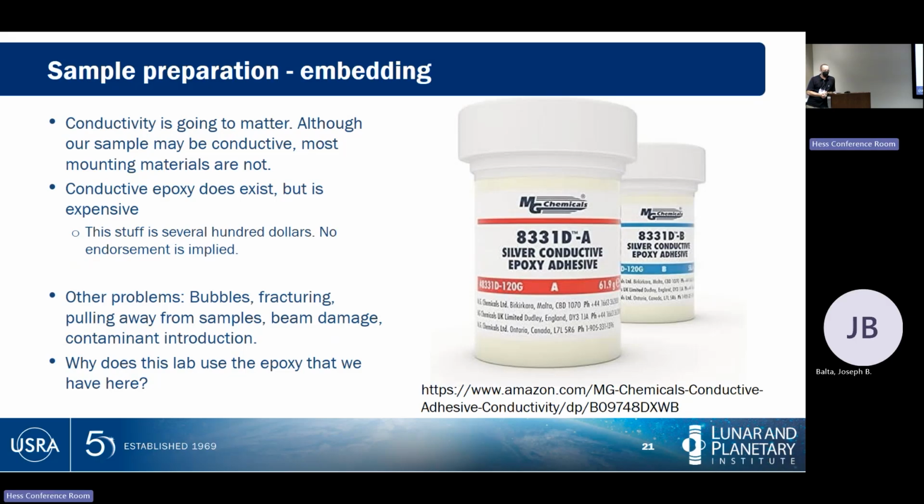So if we want to measure water contents in a moon rock, which is a thing that people measure, you cannot epoxy mount your sample. You have to come up with other things. They have creative methods of using a soft metal and embedding the sample in a soft metal piece of indium or something like that for those types of measurements.